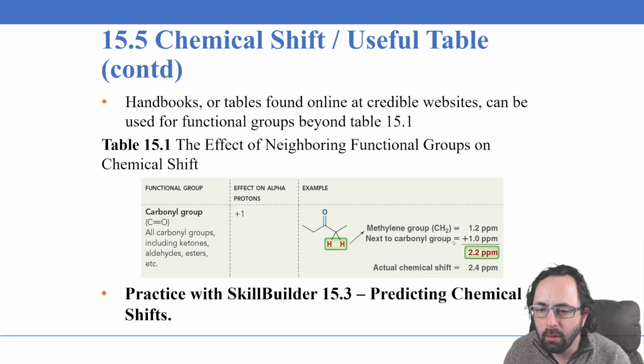In particular, we were focusing, as we left off, on the chemical shifts produced in proton NMR spectra due to the inductive effect of a neighboring electronegative atom, either directly attached to the same carbon where the proton is, or on an alpha or even a beta carbon, in which these effects will decrease until after the beta carbon they essentially go back to no effect, being more than a couple of carbon atoms away.